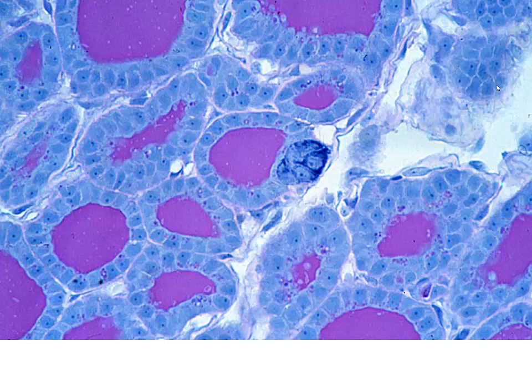So once again, we have our follicular cells, our principal cells, and then in this particular one in the very center, you can see the disruption of that organization. And these are the parafollicular, or C cells, because these cells are going to be producing calcitonin.